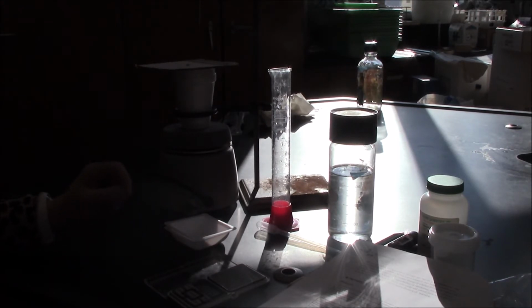And so what we're going to be doing in the first part of the lab is determining how much energy the calorimeter absorbed from the hot water, and then calculating a heat capacity for our calorimeter, which we can apply to the second part. The second part is truly the inquiry part, and we're going to be taking into account the heat capacity of the calorimeter when we do all of our data measuring, experimenting, and so on and so forth.